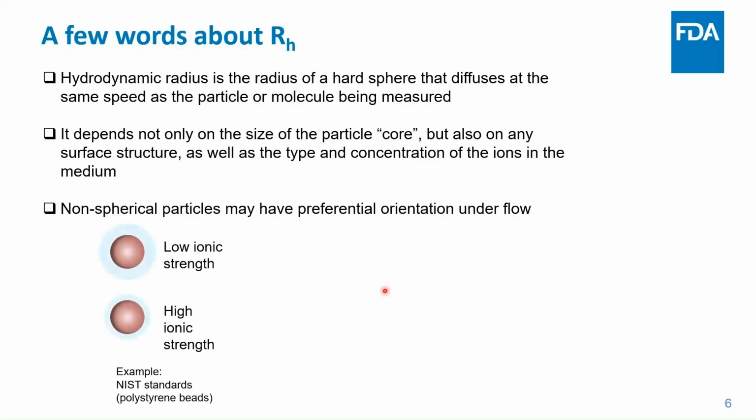And so the first example here: if you have a polystyrene latex bead, it has some amount of hydrated surface. By changing the ionic strength, you're changing the screening length, the Debye-Hückel screening length, which has to do with the number of adsorbed ions on the surface, as well as basically the structure of hydration of water molecules around the surface.